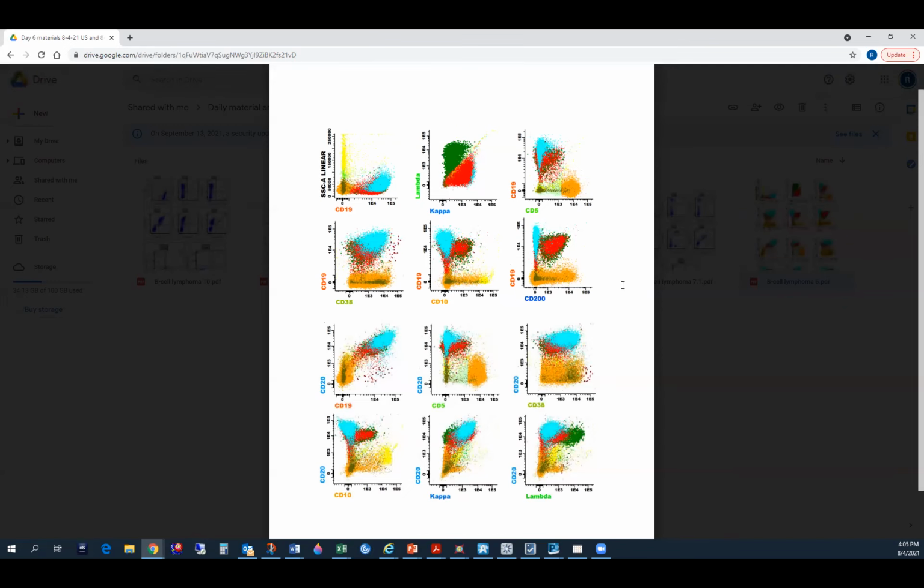Right. So, 200 is negative. It doesn't carry any significance as such. You can say it does not have a phenotype of CLL in this one. Okay, so negative 200, we were like, it is negative in mantle cell, right? That's right. It is negative in mantle, but you don't call mantle by flow anyway, right? Yeah, we don't. So I would probably leave it as CD5 negative, CD10 negative, kappa restricted B cell neoplasm, and then correlate with morphology. Exactly. That's exactly what we need to do for this case.